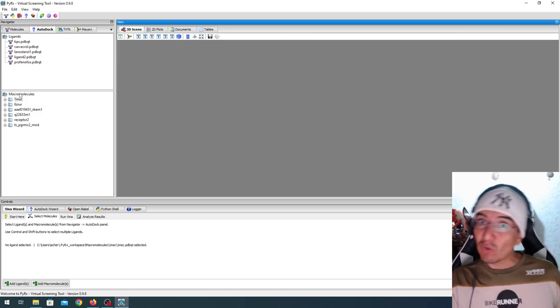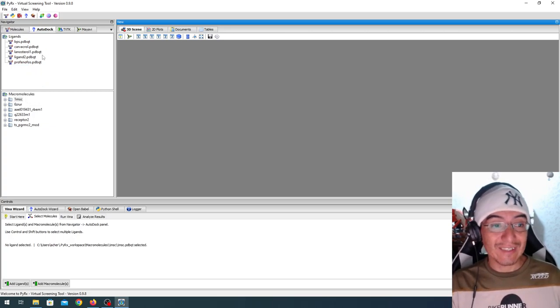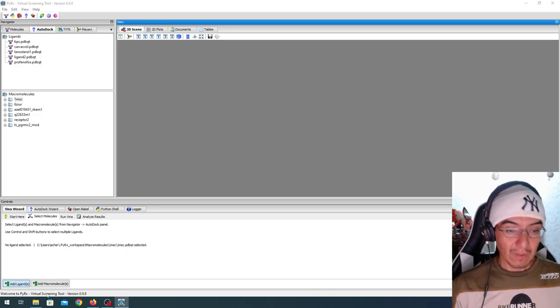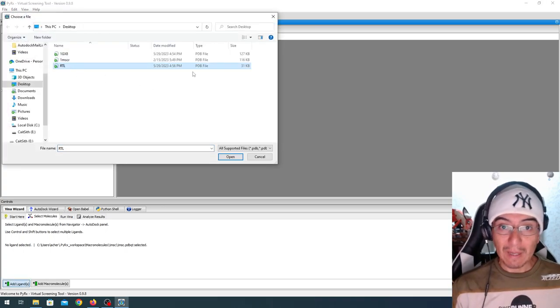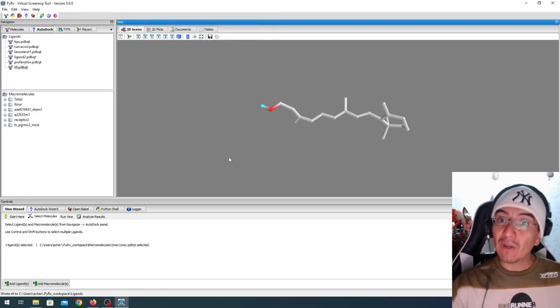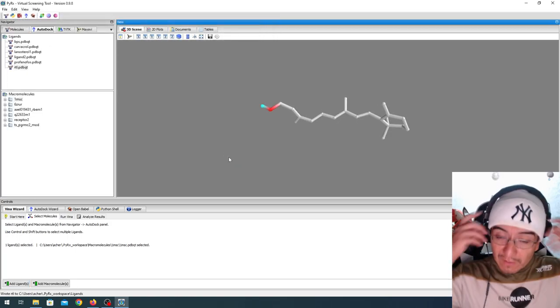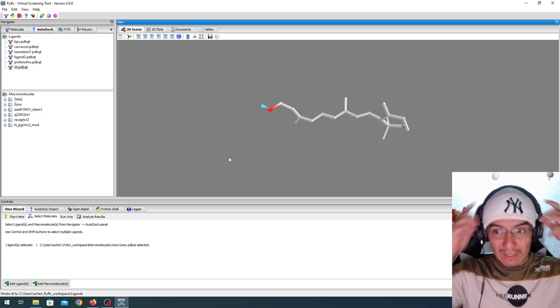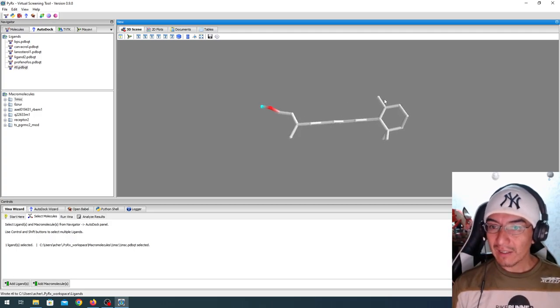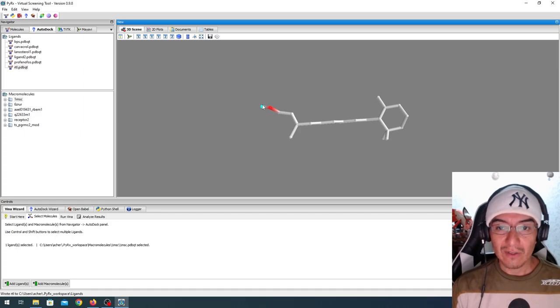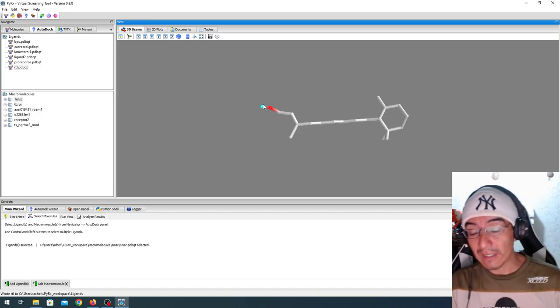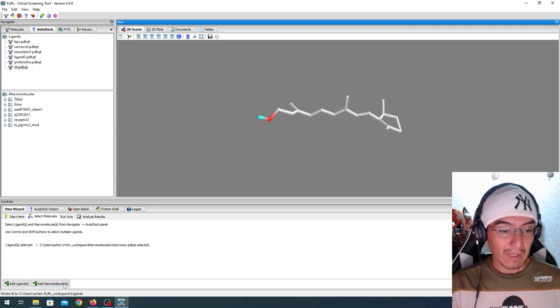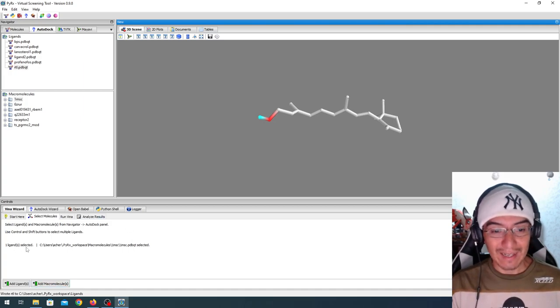As you can see, this is the way to remove results or exercises from here. I'm going to add ligands, and I'm going to click here, and select my PDB file, which is going to be prepared within the interface. Here we can see our ligand, retinol, with only the hydrogen for the alcohol, the only one that can make hydrogen bonds, and no other. And it appears as selected ligand.